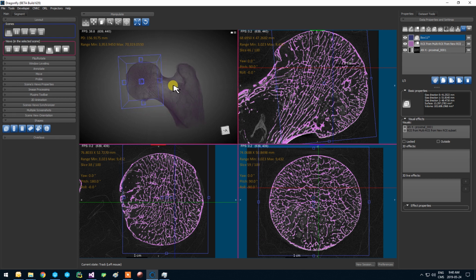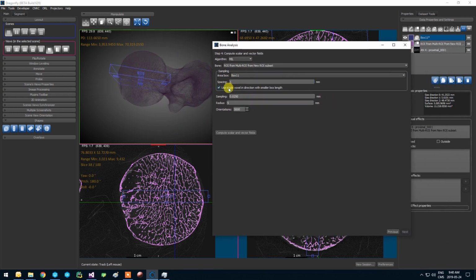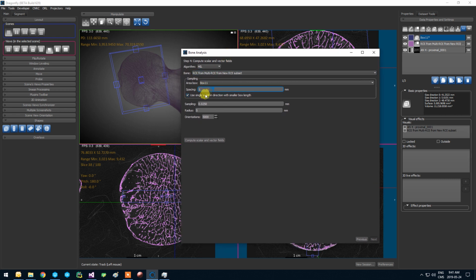Usually we want to do that. Let's say I want to analyze a slab, so I will put my box this way, and I may have a very dense grid on these two other directions, but if I check this checkbox, then I will have a single line of points in here. So for 2D analysis it is very good, and sometimes you can start with this to evaluate the parameters. It will be faster to compute, it will take less memory, and you can then evaluate what you need. So let's start with this, and then we'll go to 3D.